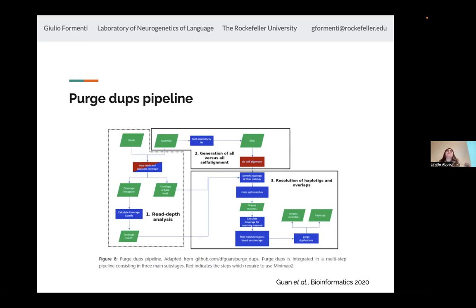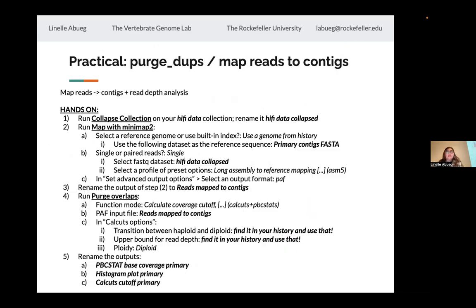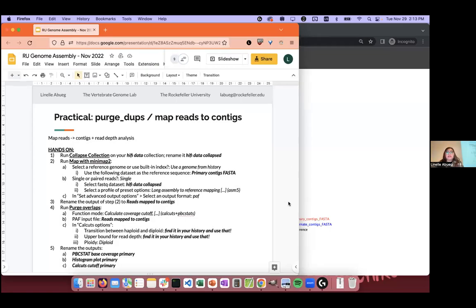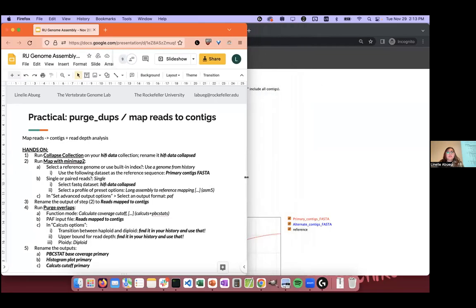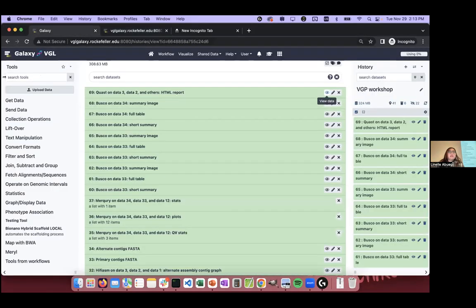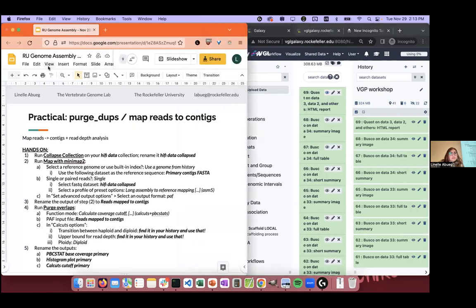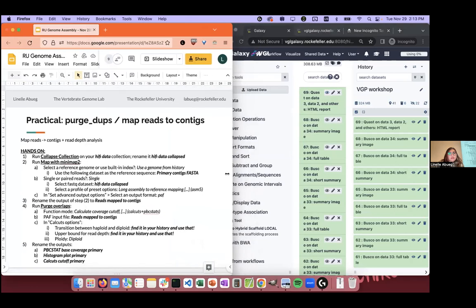In the case of the, actually, maybe I'll ask the question. Okay. I'm gonna pull these up side by side so I can do the, here we go. Let's go back to Galaxy. Is this visible? Let me just fiddle around a bit. I think this is okay.